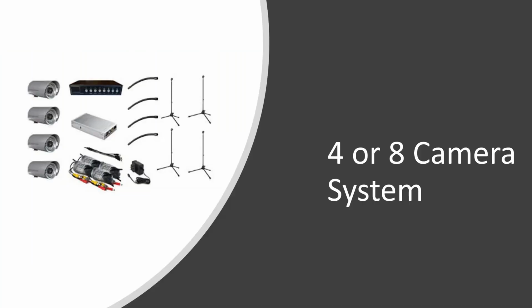All right, so let's move on. What I'm going to talk about now is the multi-camera. So I think Brenda said approximately half of you are doing a multi-camera setup or multi-subject. So you may already have camera systems in place. If you don't, BIOPAC offers two packages. One is a 4-camera, one is an 8-camera. What I'm going to be demonstrating is the 4-camera system. The only difference between the 4 and the 8 is basically the number of cameras.